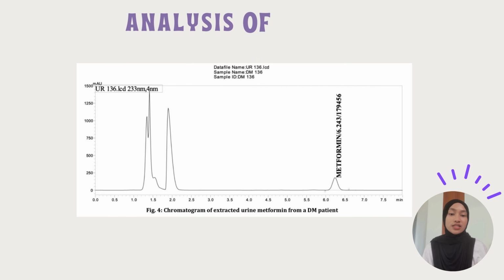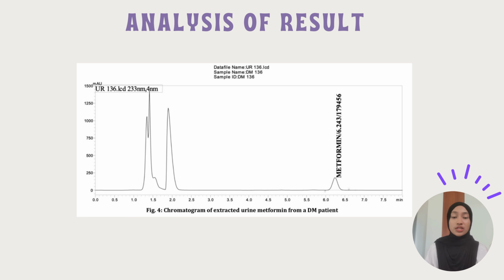For the analysis of results, the retention time: the chromatogram shows a distinct peak at approximately 6.24 minutes, which corresponds to the retention time for metformin. Retention time is characteristic of specific compounds under the same chromatographic conditions, confirming the presence of metformin in the sample.